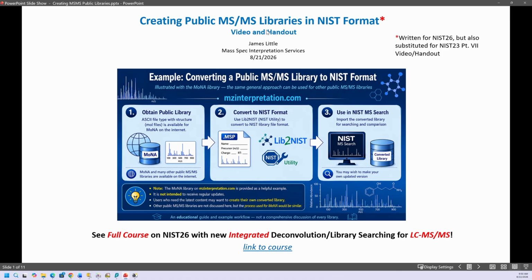This video and associated handout is on creating public MS-MS libraries in NIST format. It's part of a full course on NIST 26 with newly integrated deconvolution library searching for LC-MS-MS, and here is the link to my website.